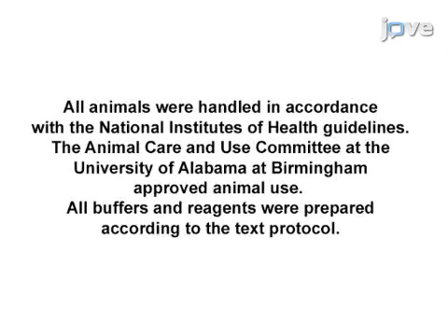All animals were handled in accordance with the National Institutes of Health guidelines. The Animal Care and Use Committee at the University of Alabama at Birmingham approved animal use. All buffers and reagents were prepared according to the text protocol.